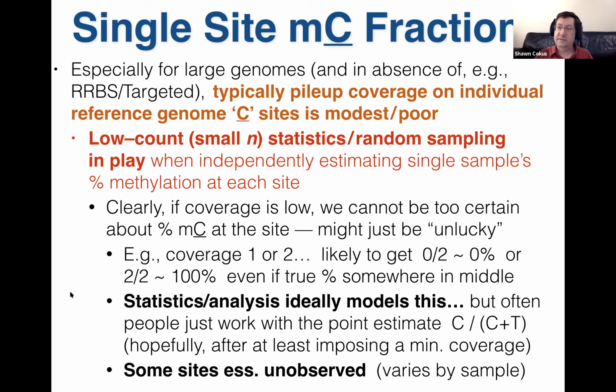But some sites then are essentially unobserved, and which subset of sites it is tends to vary per sample. And that comes into it when you start comparing samples against each other, because not all samples can be observed at all sites.